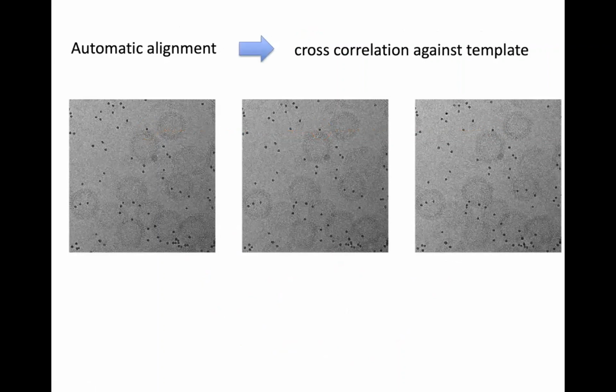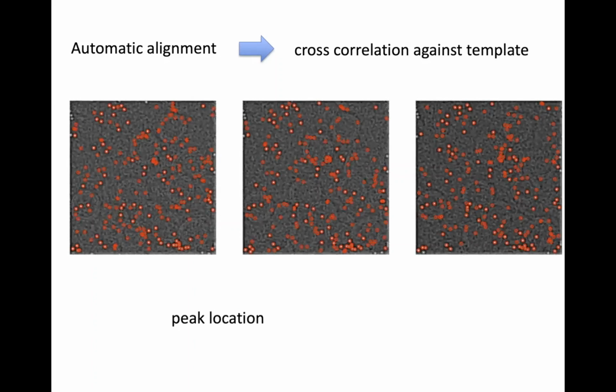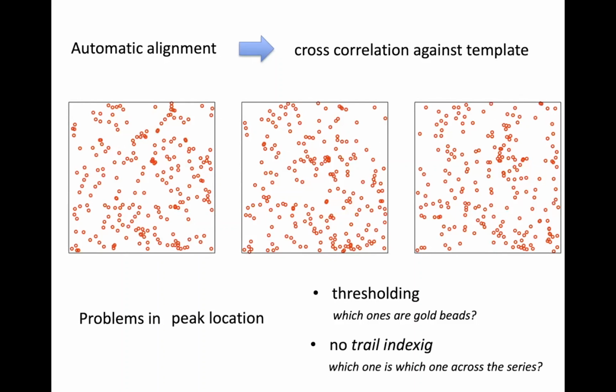If you want to do it automatically, what you would do is make a cross correlation against the template. We get some peaks. We have to threshold them somehow, and maybe it's not totally clear what is the best threshold. In any case, what I mean is that when you give your computer this, you can see that things are not as trivial as for the human operator.